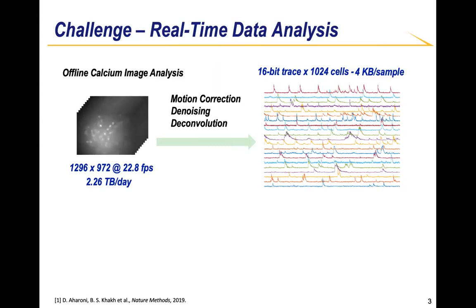Expensive computation steps sit in between, including the motion correction, the denoising, and the deconvolution. The existing analysis pipeline processes the calcium image video offline. This process requires all of the data to be stored on the disk.